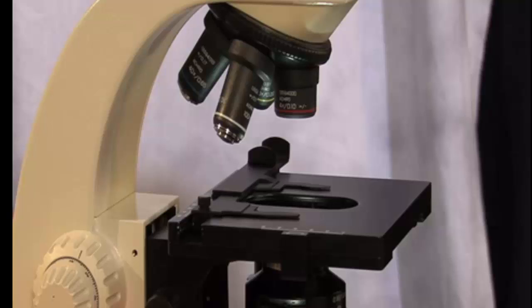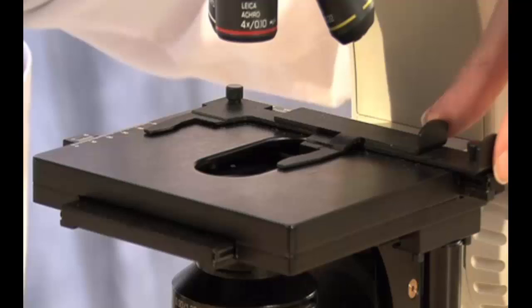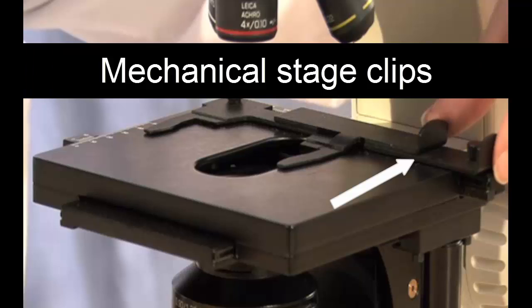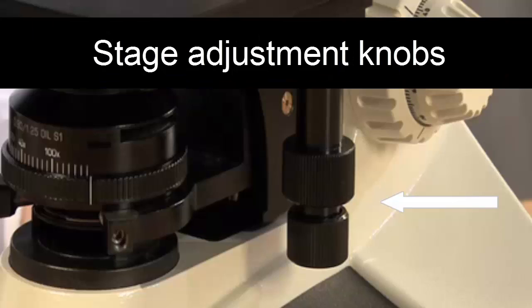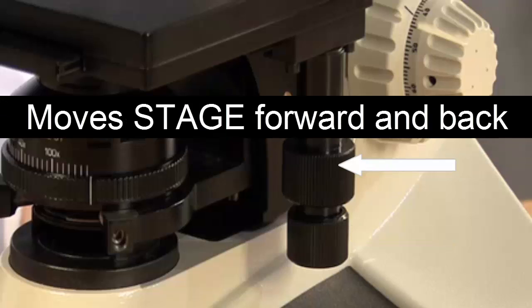Continuing down the microscope, we see the illumination system. Here, there is a stage which will give us a place to put our slide. There are also mechanical stage clips here on top and stage adjustment knobs just beneath the stage. The bottom stage adjustment knob moves the clips from side to side, while the top stage adjustment knob moves the stage forward and backward.